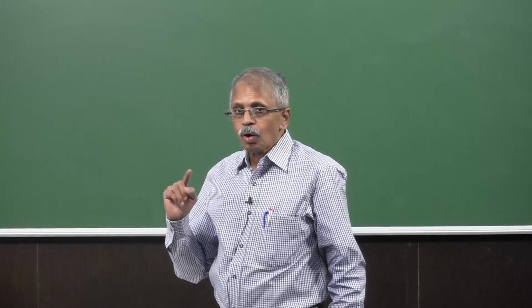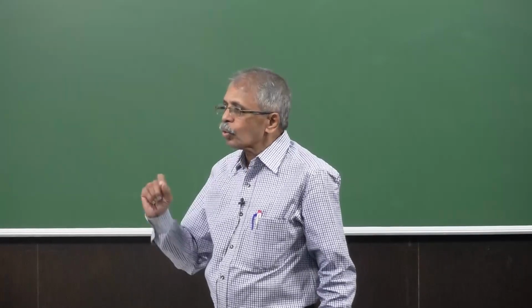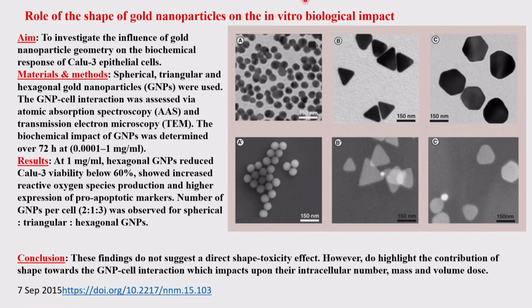The details of how to do the instrumentation are not important, though I mentioned them in the early classes. So here you have additional ones, triangles. You can see that, of course, there is a difference in size, etc. Then you have these hexagon-shaped structures. Of course, if these get carved out, they will become more or less like a sphere.